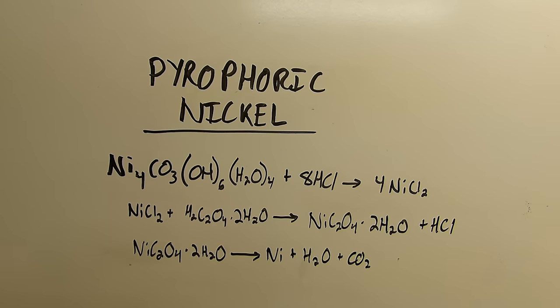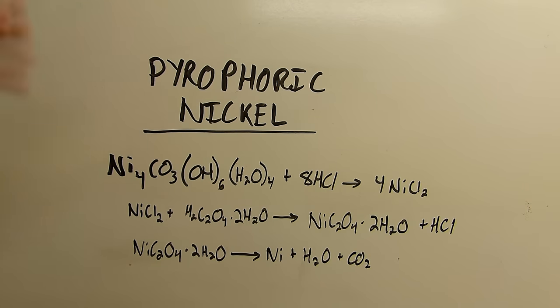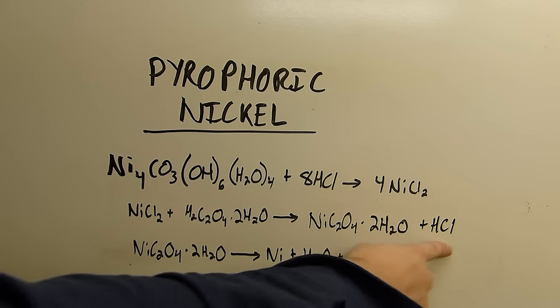It's quite an affair but if I add hydrochloric acid to it I'll end up with four nickel chloride in solution along with some carbon dioxide and water. The nickel chloride can then react with oxalic acid dihydrate which I will add as a solution to form nickel oxalate dihydrate which will precipitate from the solution since it's not very soluble in water and some hydrochloric acid.